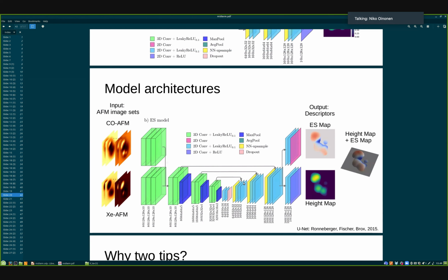Also, the upsampling is done by nearest neighbor upsampling, which is not a very intelligent way of upsampling, but it's very fast. So the convolutions can smooth out the differences and pick out the interesting features, or at least that's my intuition. But of course, it's kind of black boxing.